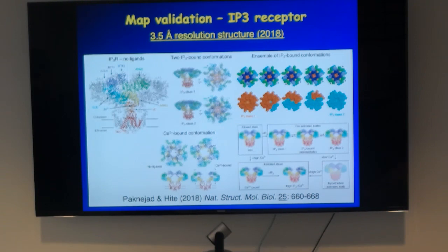Could you use NMR to separate those 2 structures if they were mixed together? I'm not sure why she's asking you an NMR question. I still don't quite understand the question, I have to admit. I think she's asking if you were to mix two different samples, like cross-linked and native state without cross-linking, could NMR separate those 2 structures?